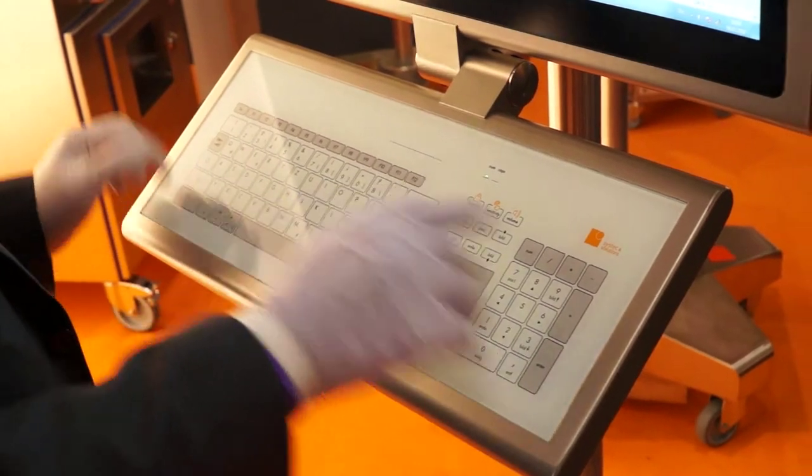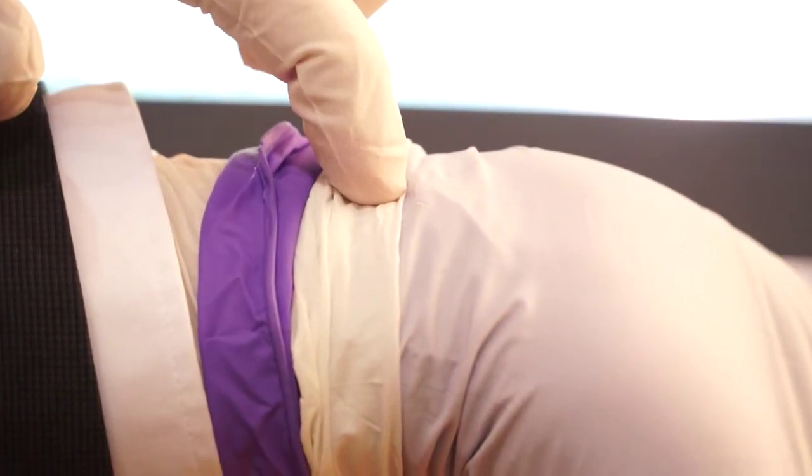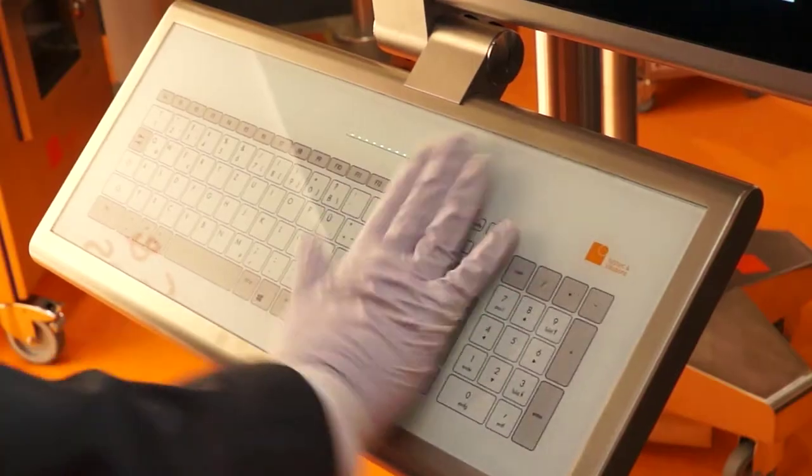The keyboard can be moved up and down for easy adjustment to the height of an operator, or just to move it out of the way. It can be operated with up to three layers of gloves and can be locked for cleaning purposes.